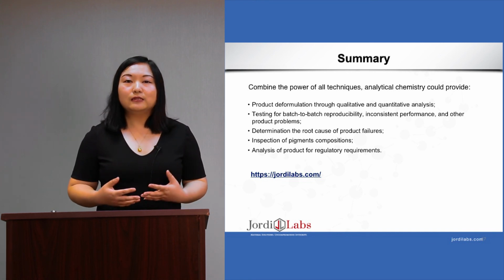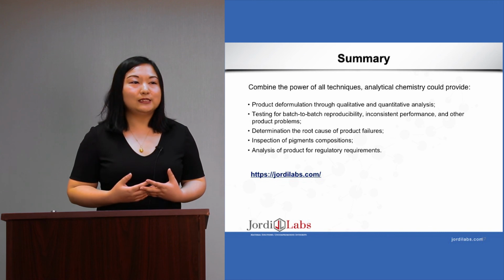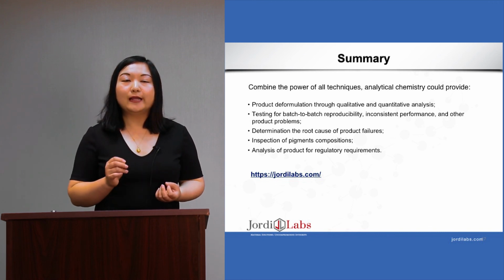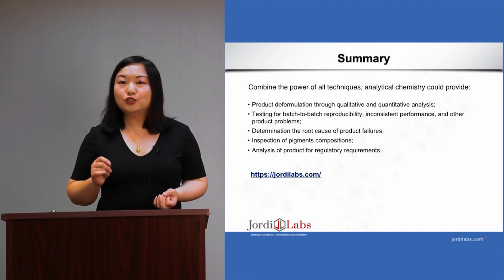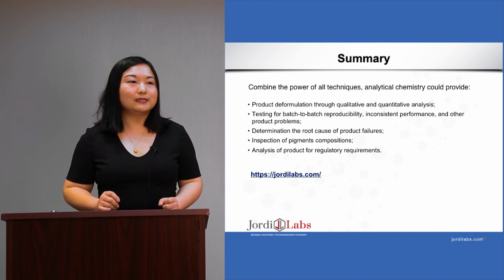And next, it's the regulatory tests where we can analyze at trace level certain compounds which are prohibited to use for cosmetic products.